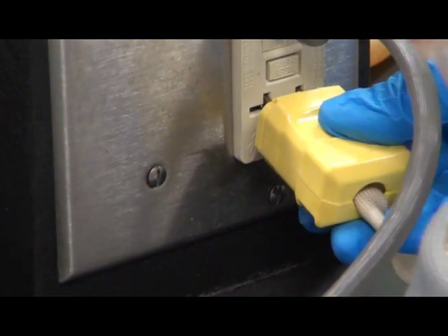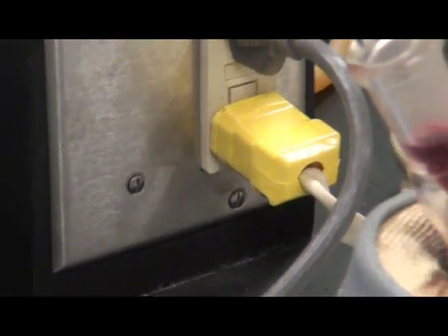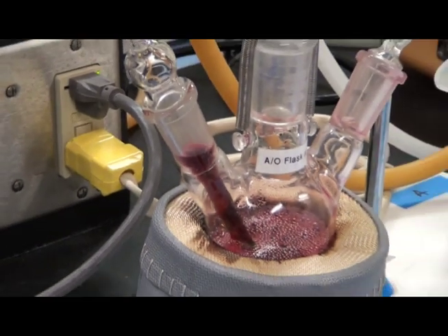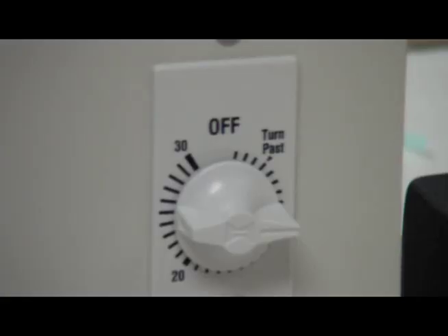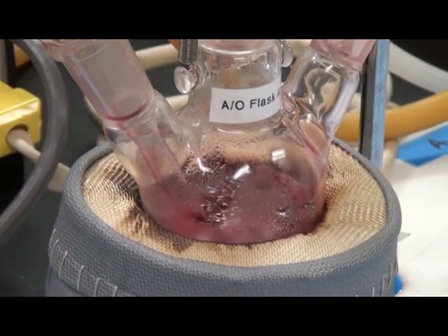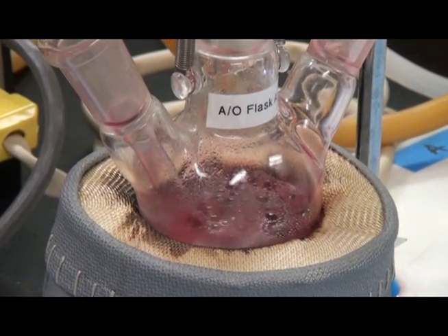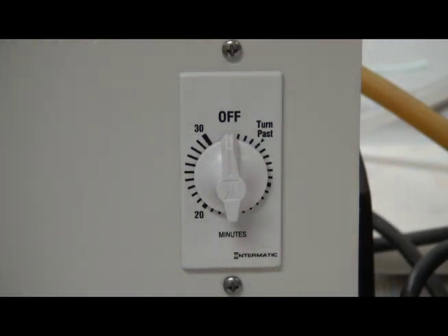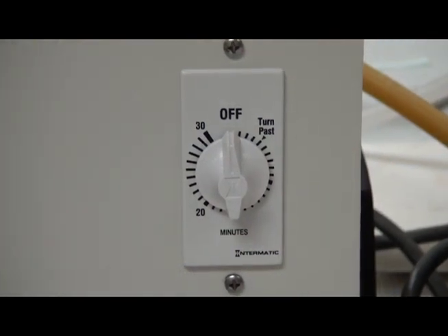Apply power to the heating mantle. When the solution starts to boil, turn on the vacuum pump and set the timer to 15 minutes. Aspirate for 15 minutes at a 1 liter per minute flow rate. The dial timer will turn off the vacuum after 15 minutes.